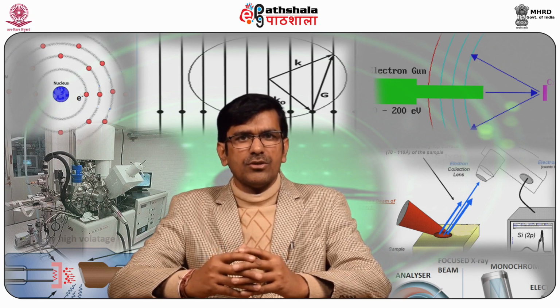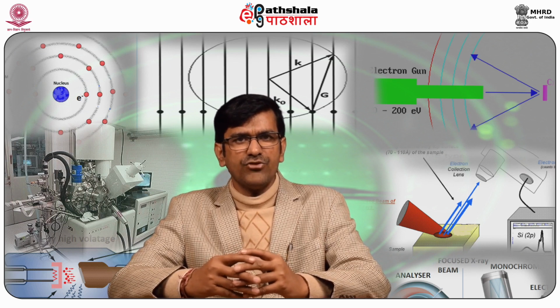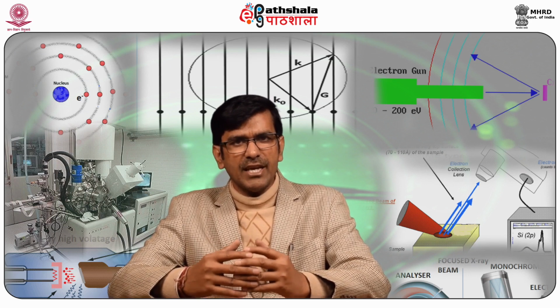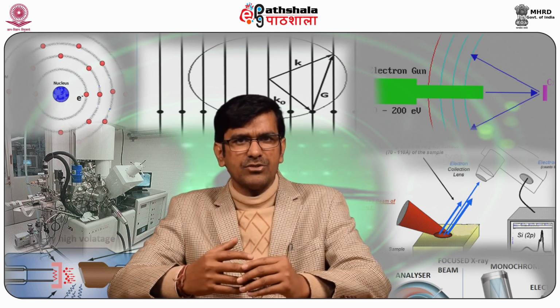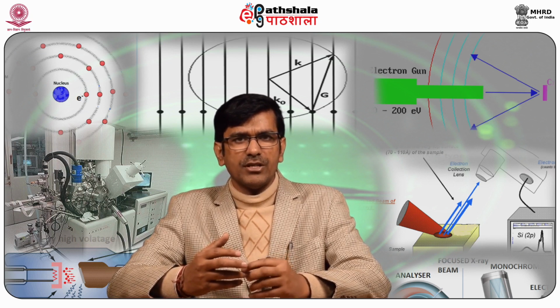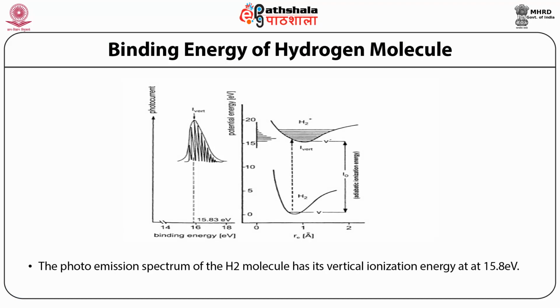The DuPont curve resolver, which uses analog circuitry, has been used effectively. Its function is in evaluating a variety of parameters. Its weakness lies in the lack of an objective criterion for the goodness of the fit. Mathematical methods have been discussed for the deconvolution of the data, with particular concern for data encountered in X-ray photoelectron spectroscopy. Talks about the binding energy of the hydrogen molecule.